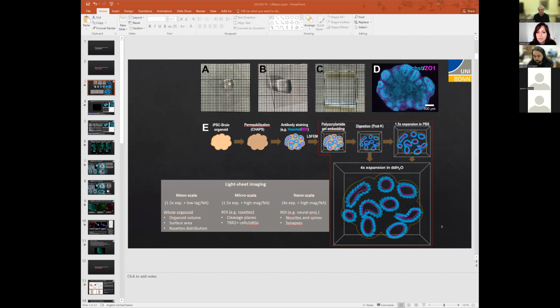Another one from Raul Sepulveda: how many channels can you detect at the same time? Does it depend on the filter wheel? In this case, I only detect one channel at the same time. Also, we have another instrument with a dual channel adapter by Hamamatsu.